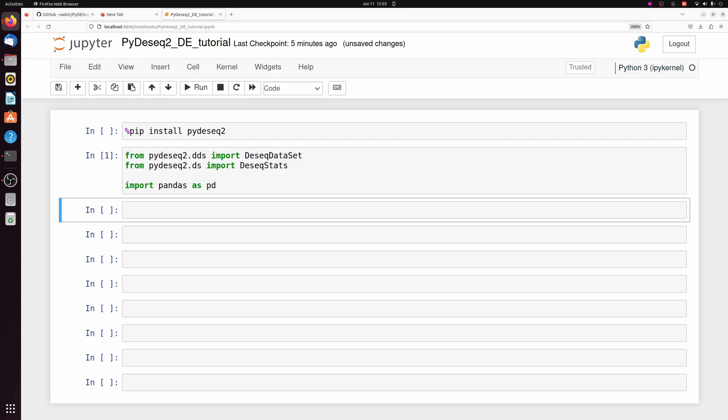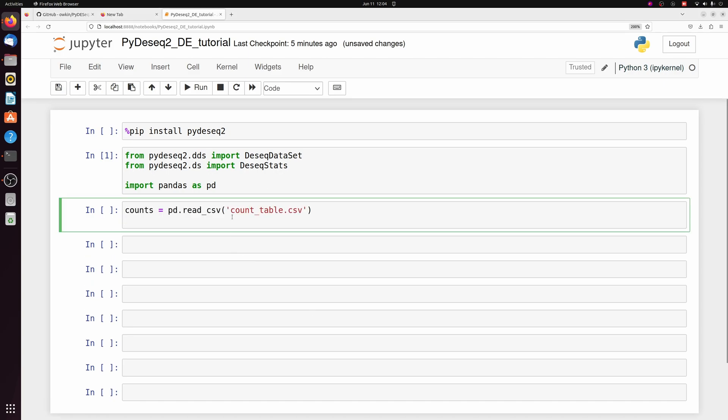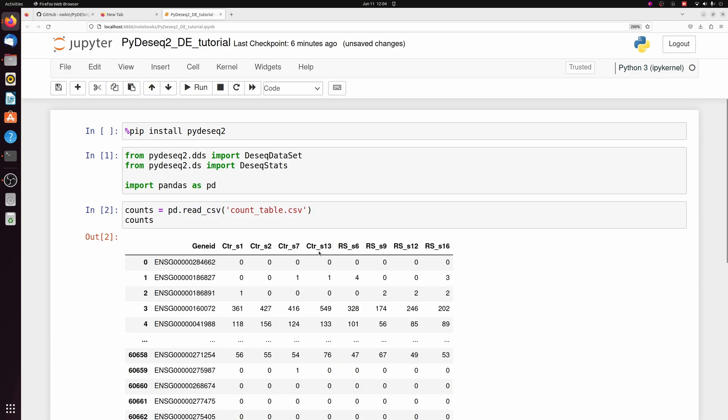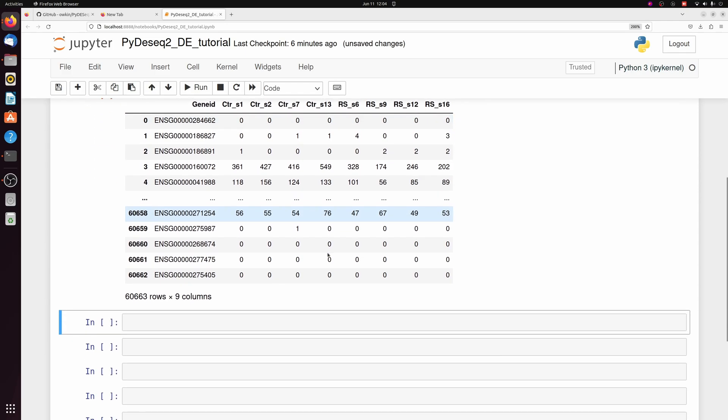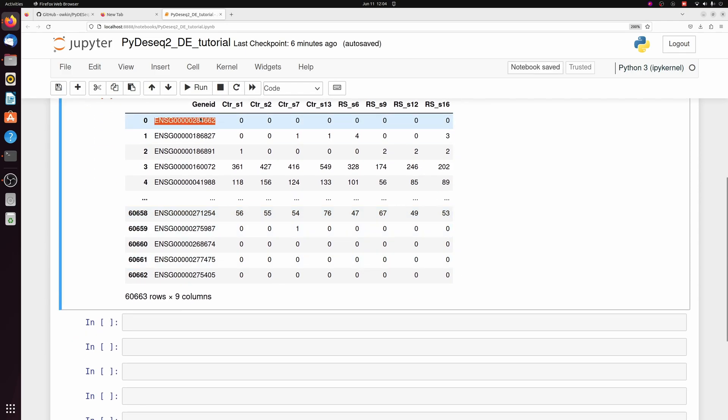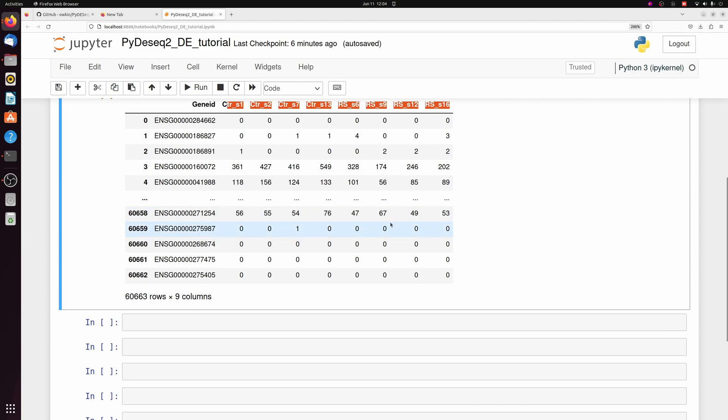I already have a counts CSV, so at this step we're assuming you have a counts CSV or any format of counts table. I'm just going to go ahead and read mine in. If it's not a CSV, you'll have to change how you import it here, but that's a pretty straightforward step.